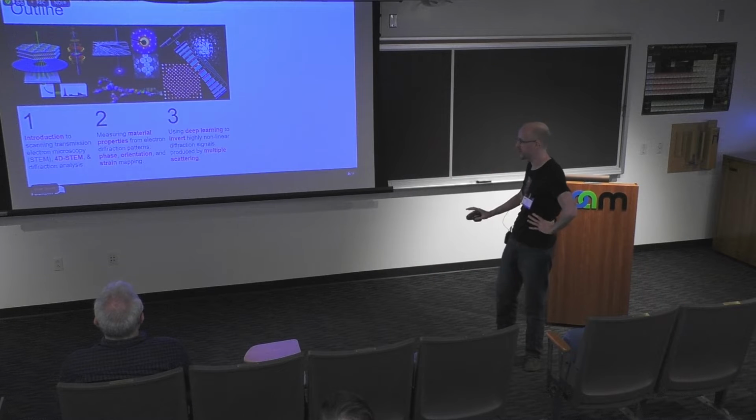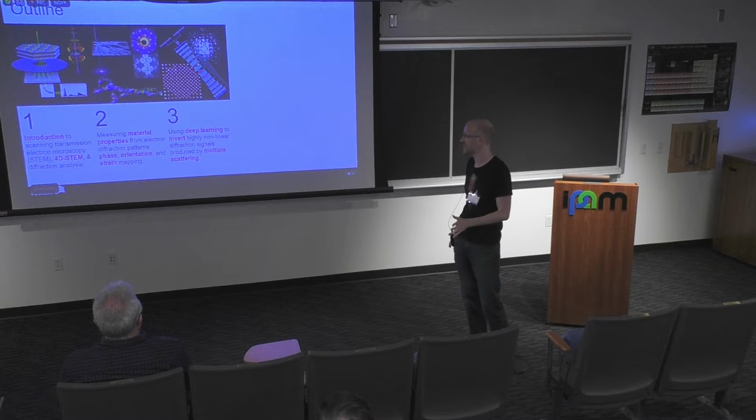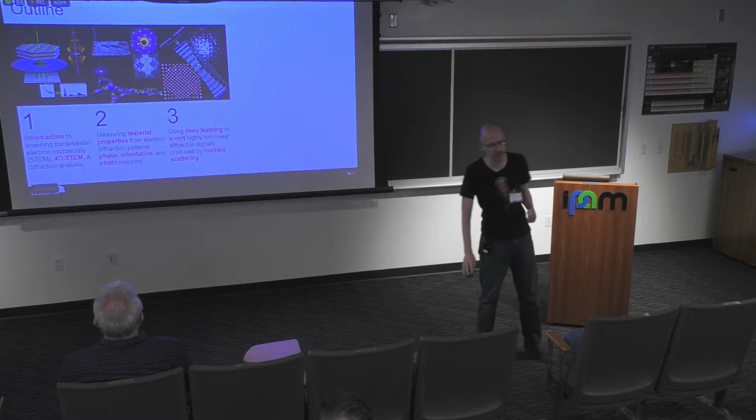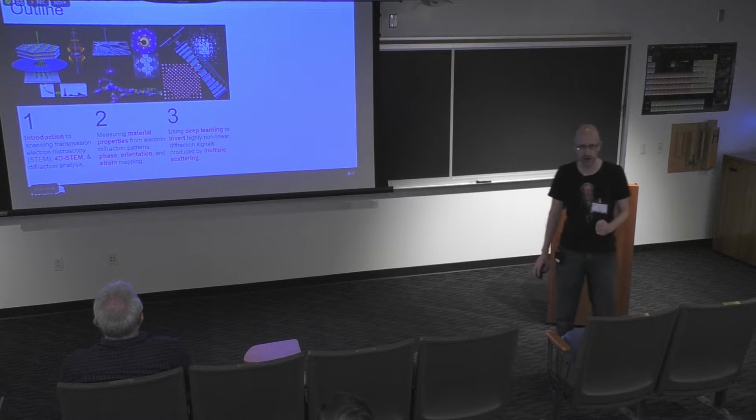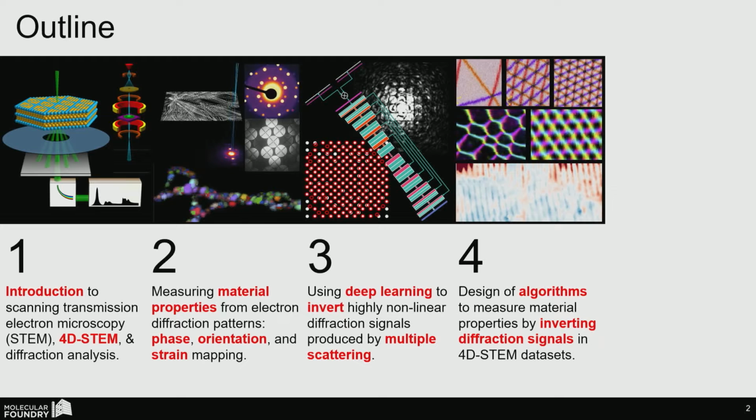Of course, you can't give a computational imaging talk in the 2010s or 2020s especially without talking about machine learning. So I'll give you one example of machine learning applications that my group is working on. And then I'm going to move on to even more complicated mathematical inversion algorithms for properties where we can't just make a simple measurement like how bright the peak is or the position of the peak. We need much, much more complicated algorithms to invert the signal that we want.